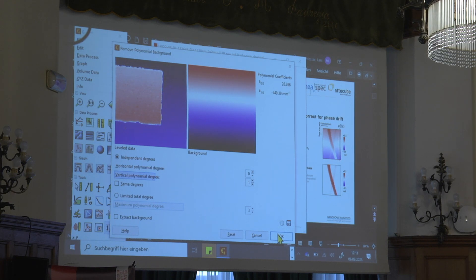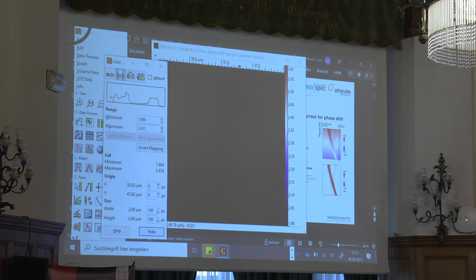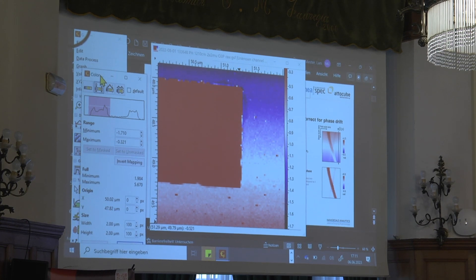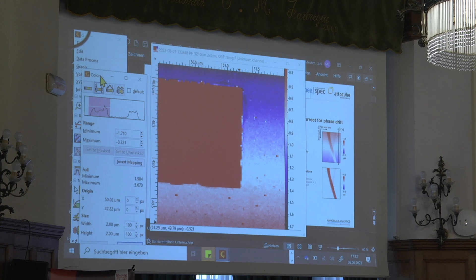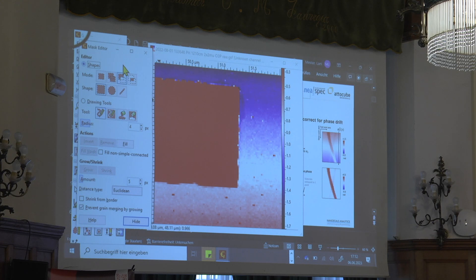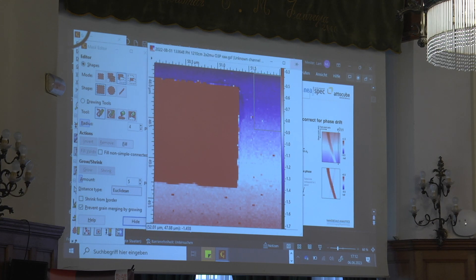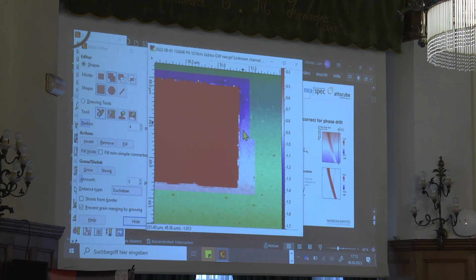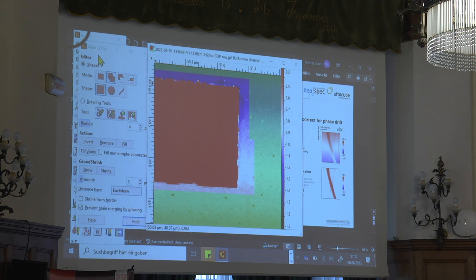We can subtract this and readjust the color scale, but what we can see is this already does not yield a good result. Even though the function is there, we have to pay attention. In this case we are averaging over the whole image and flattening a plane onto the whole image, so we have to be more careful. What I like a lot about Gwydion is you can just draw on the image which areas you want to use to fit this plane. If you want to code this green area in MATLAB, it's a bit more difficult.